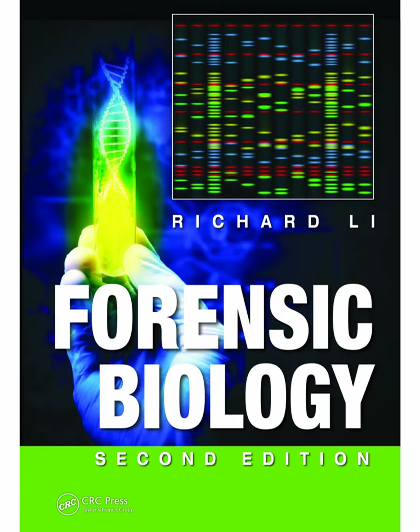How does that help identify, say, blood? Well, we often use tandem mass spectrometry, MS/MS, and typically we use a bottom-up approach for complex forensic samples. First, you take the protein mixture from your sample and use an enzyme, like trypsin, to chop the proteins into smaller pieces called peptides. Okay, break it down first. Then the mass spec measures the masses of these peptides. It can even select a specific peptide ion, smash it into even smaller fragment ions, and measure their masses too. That's the tandem MS part.